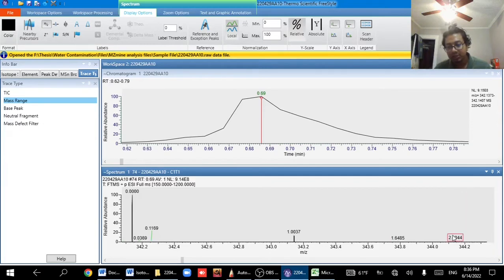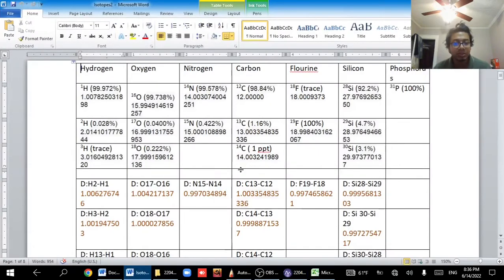2.004, you can see that here this is a little peak, I think. And I'm sorry, I cannot write on that graph. This is the peak of 2.0044. Remember that I need to find the isotope difference here.